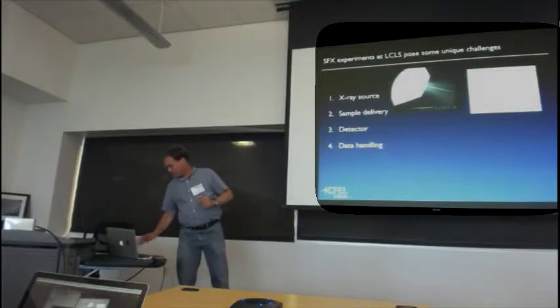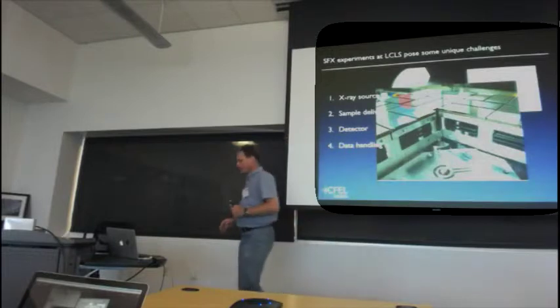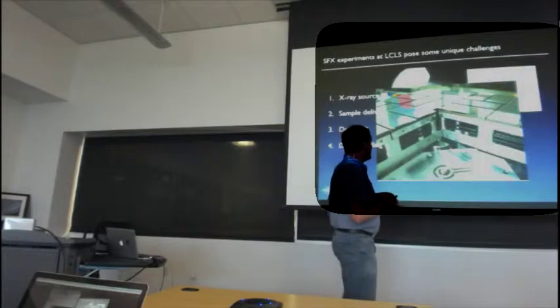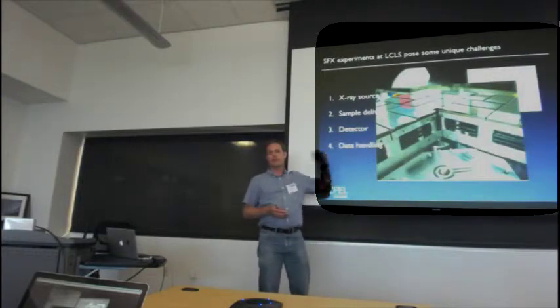The other thing is you have detectors that have come a long, long way in the past years. I would venture to say actually that we're almost beta testers for these detectors. This is a cutaway of the CS-PAD detector. It's the detector at CXI at the moment.